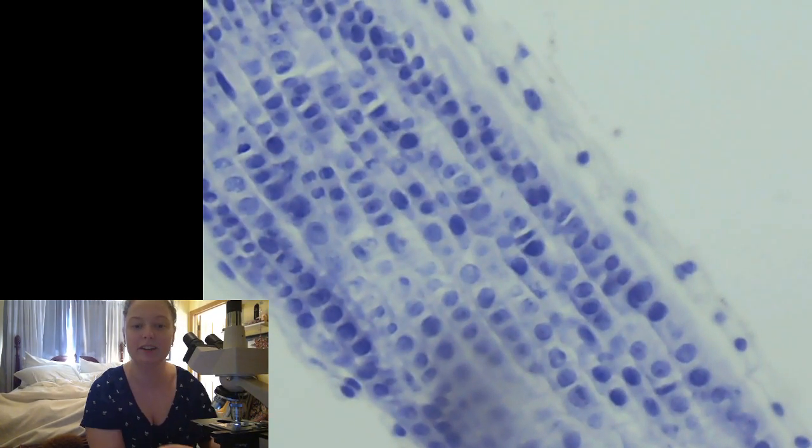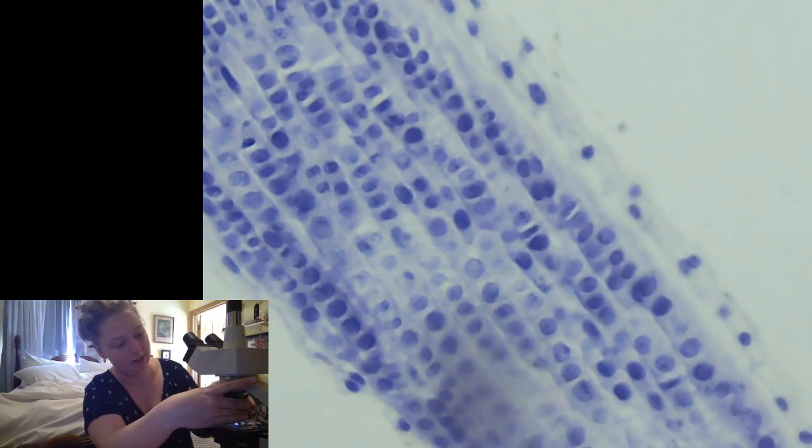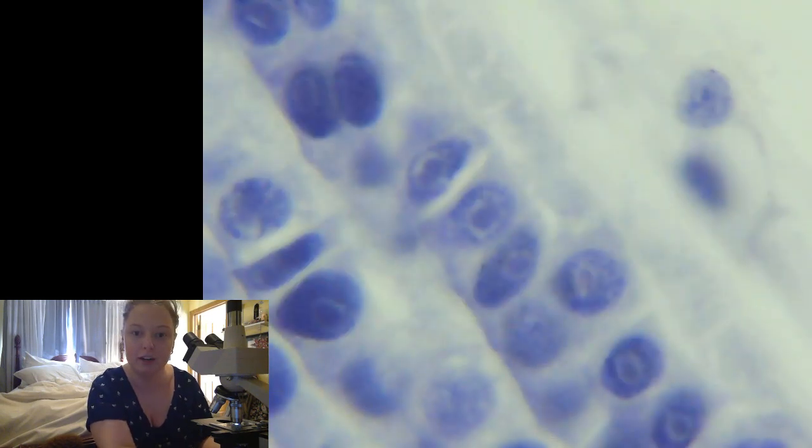So all of the different cells are going to be going through mitosis. So then let's see if we can go one more. Oop, a little bit blurry there. All right, there, let's see what we can see.